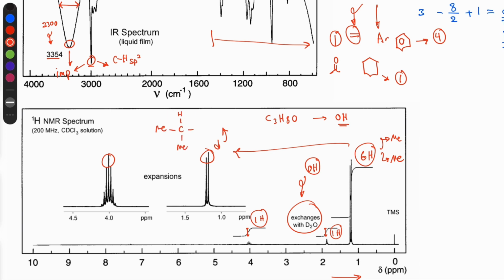So we have one more thing here. We have used all our carbons, but we still need to place this hydroxyl group somewhere. We don't have anywhere else to put it, so we are going to add it here, attached to the CH that we explained before. So there will be one more signal. There is no need to actually interpret this signal, but as we know, we have 1 more hydrogen that we didn't talk about, and this hydrogen shows a heptet splitting pattern here.